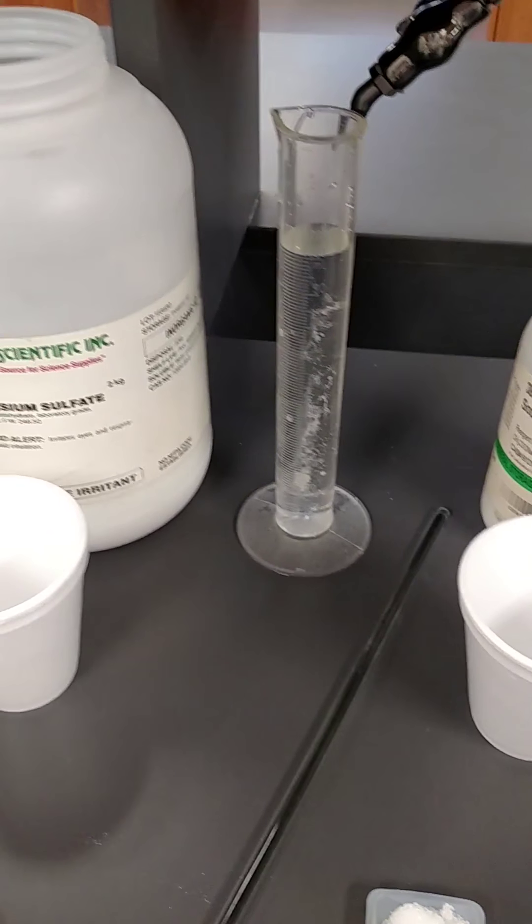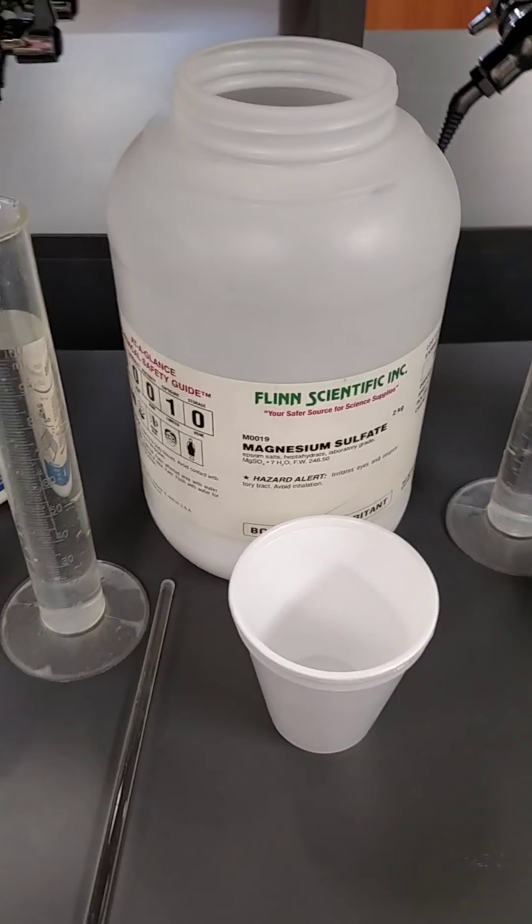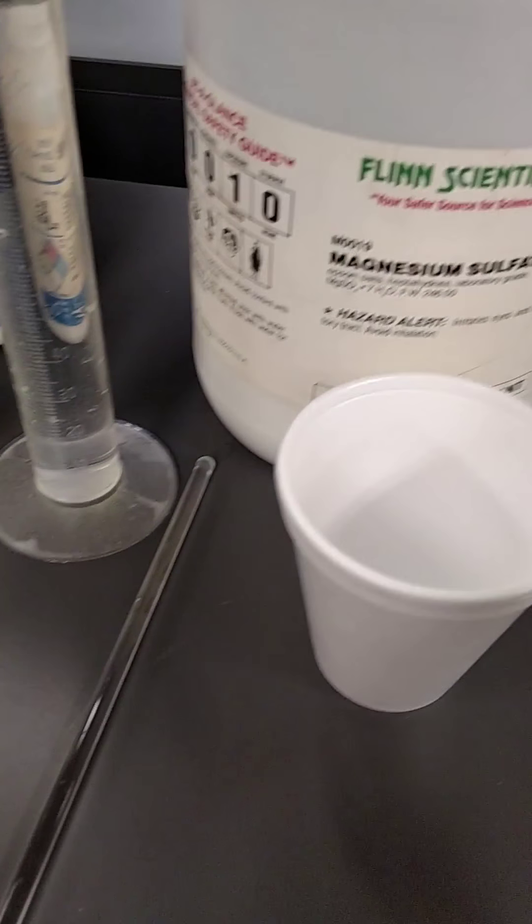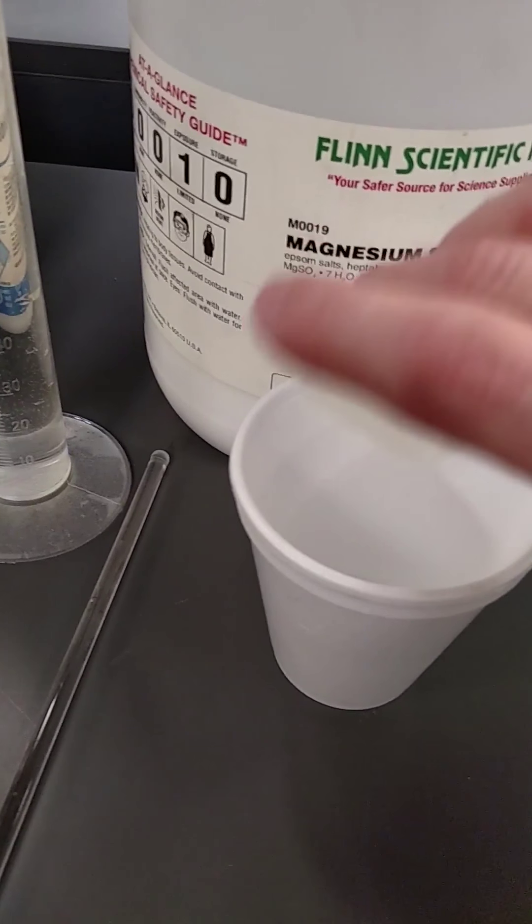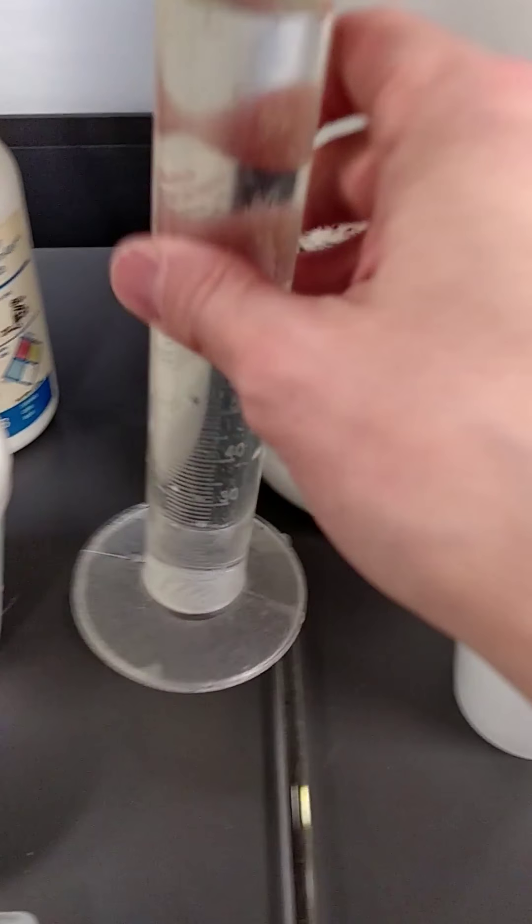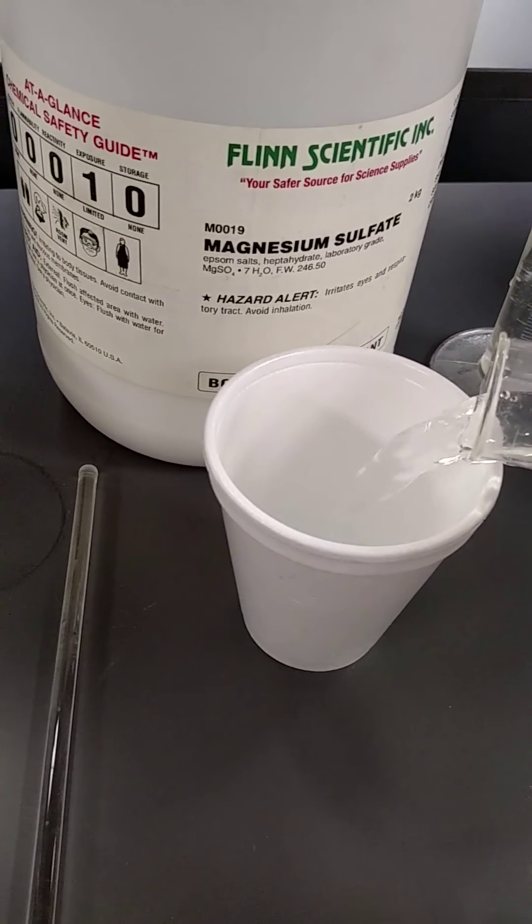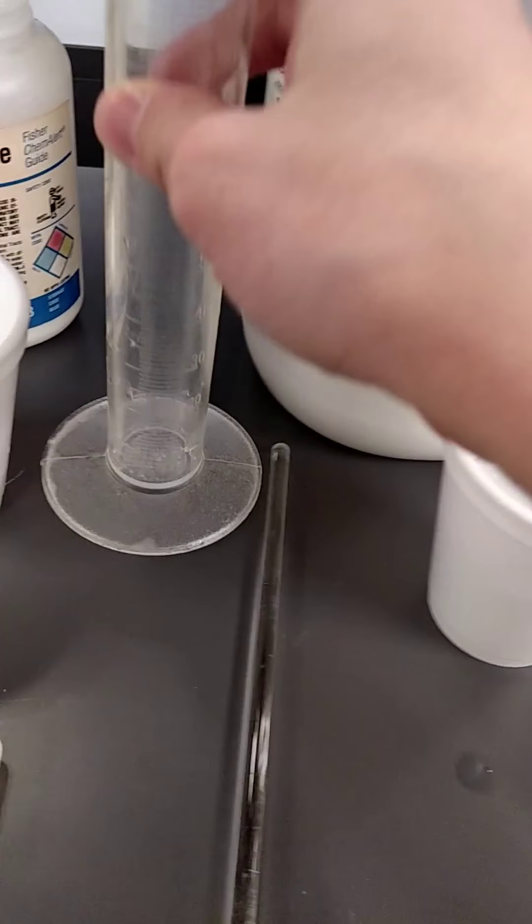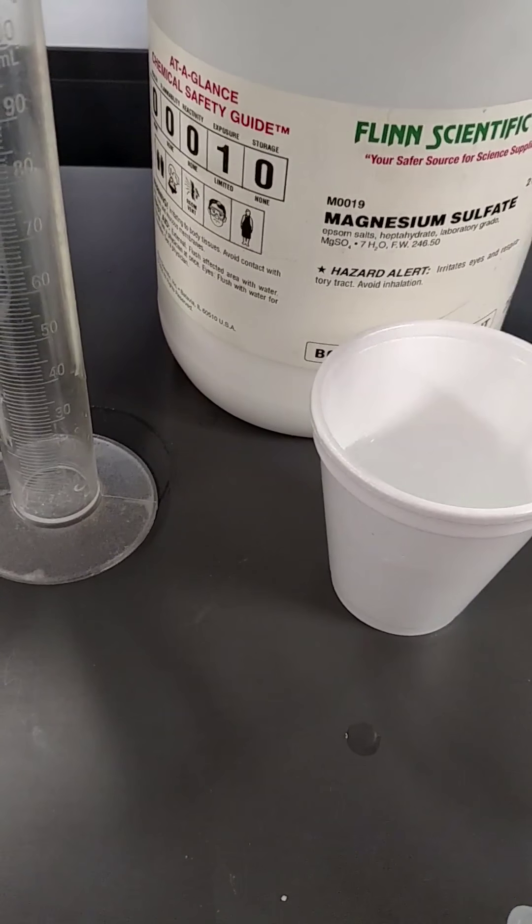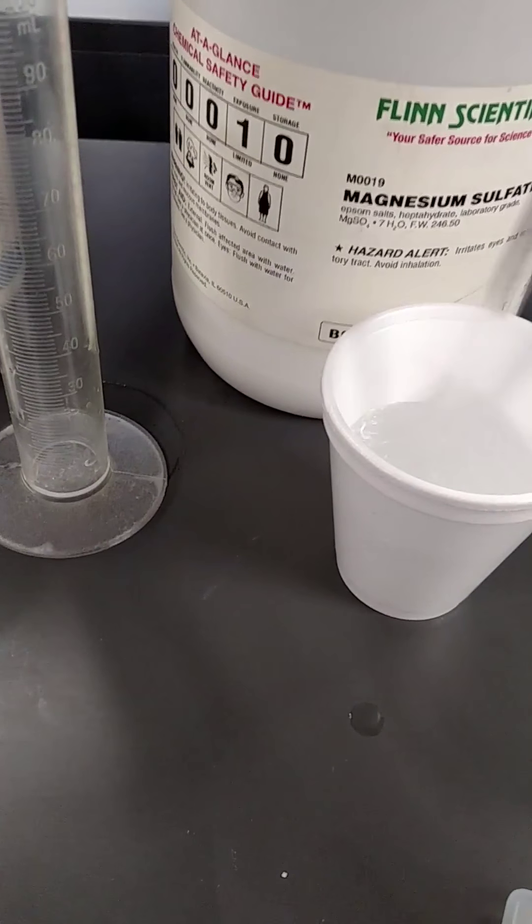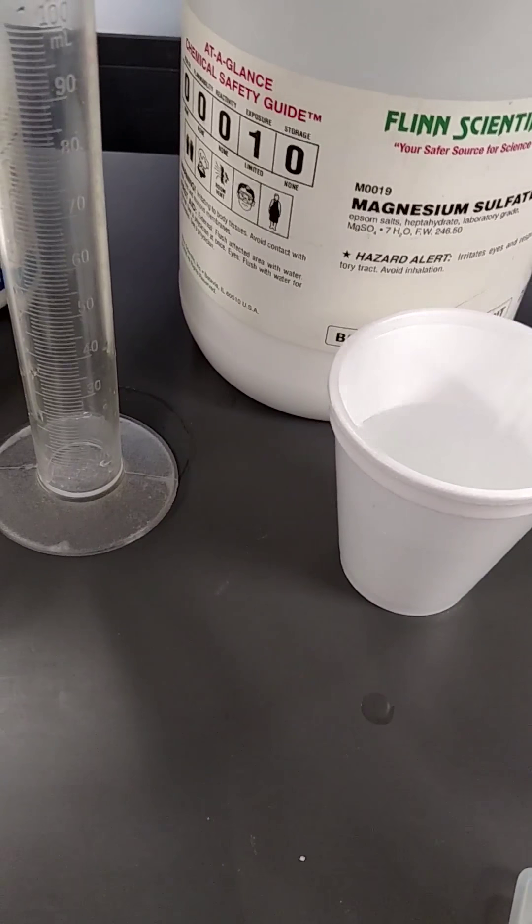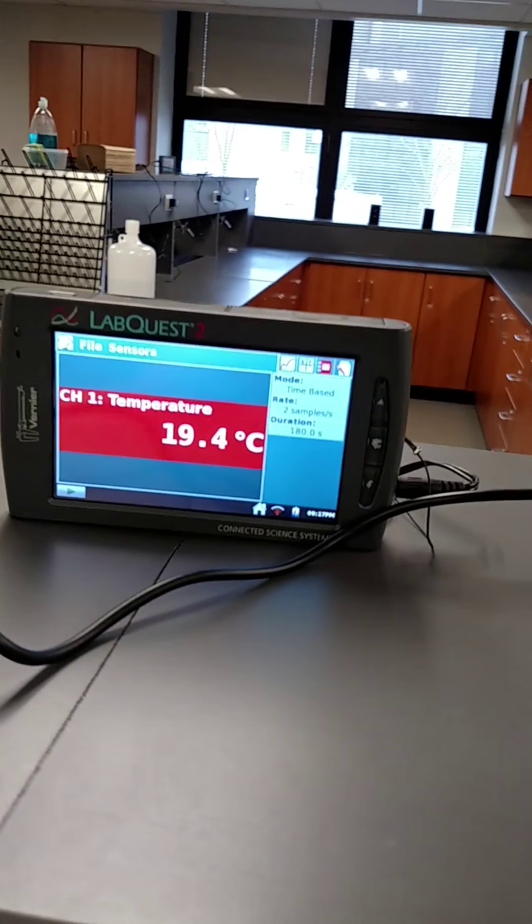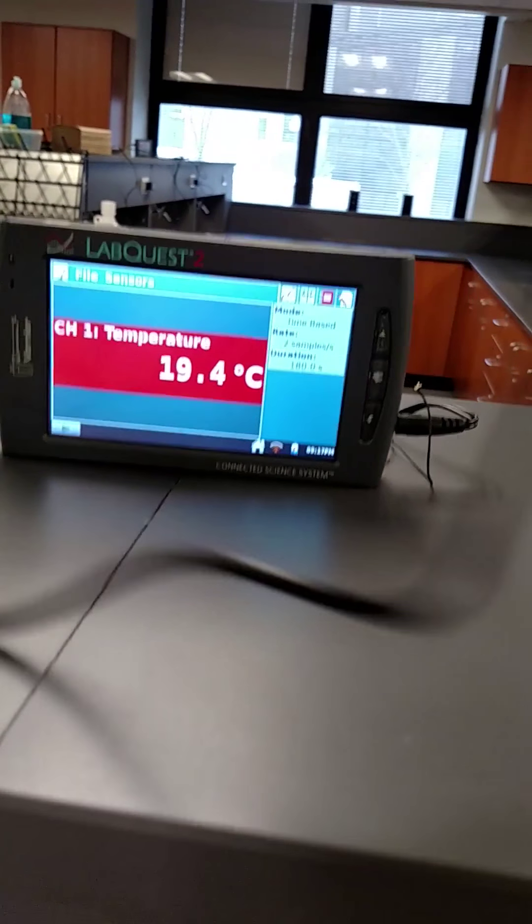Let's finish up now with our last four chemicals. Next up is magnesium sulfate. I add my five grams, I add my water, I give it a stir. Initial temperature, 19.4.